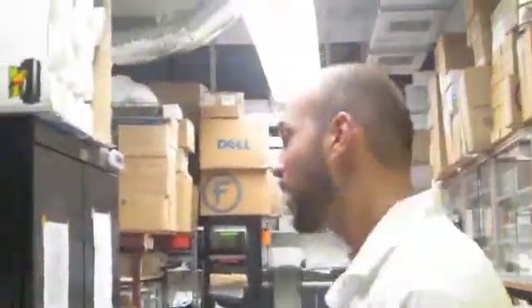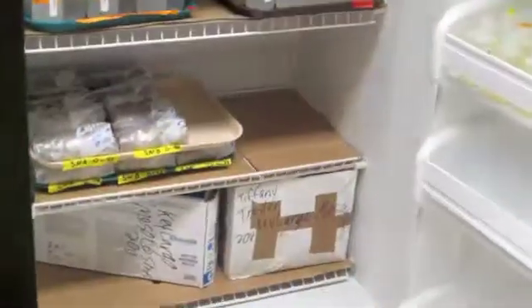Okay, now this is our lab that we work in, so maybe we'll be able to say a little more about what goes on in here. In this lab, we analyze water and soil from different transects in the Everglades, looking for water quality, water contaminants. So here in this fridge, there's a lot of water from different transects in the Everglades. We also have some soils that we analyze, carbon, nitrogen, phosphorus levels.